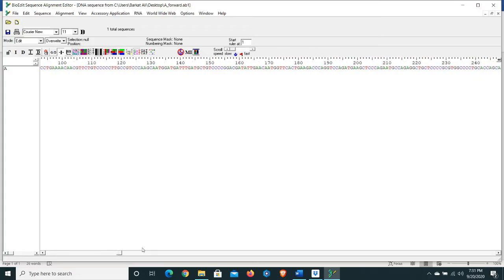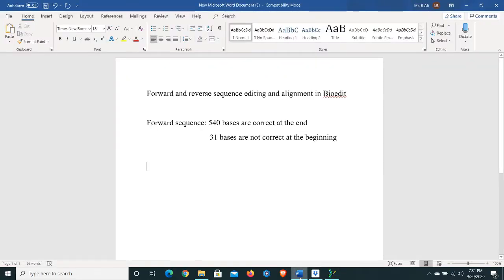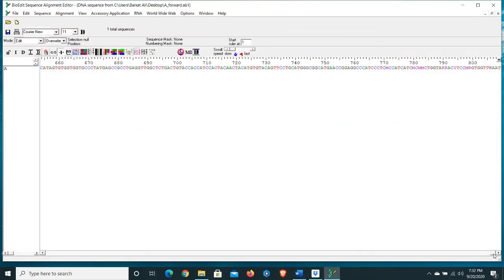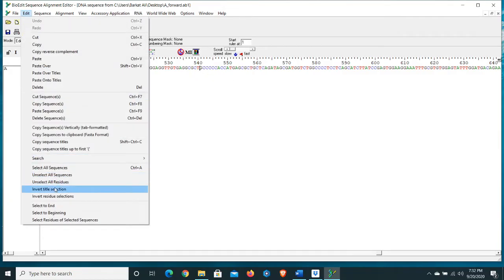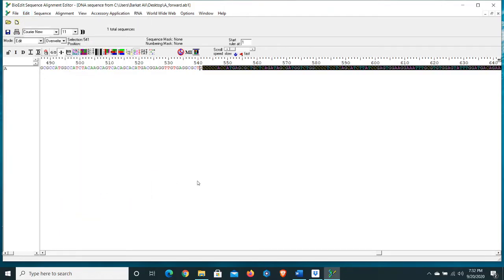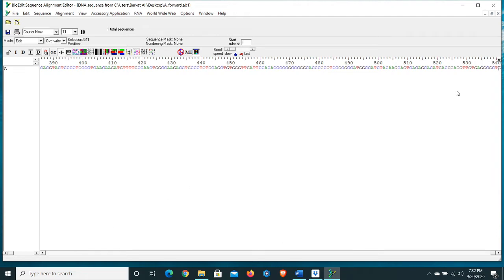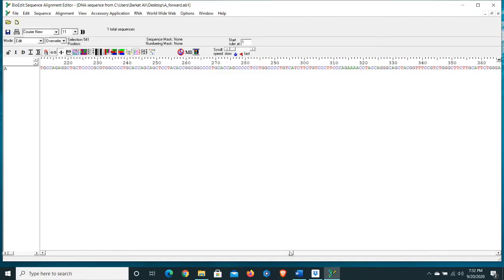Let's go to the end of the sequence. We have recorded that 540 bases are correct at the end. Mark this point at position 540, and now we need to delete this section after 540. Go to Edit option and select 'Select to End' and press the Delete button. Now we have deleted this fragment after 540 bases.